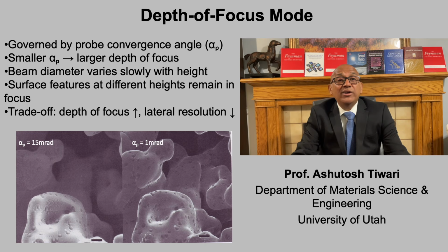However, there is an important trade-off. Reducing the convergence angle increases the effective probe size, which leads to a loss of lateral resolution. Depth of focus mode, therefore, prioritizes three-dimensional clarity over the ability to resolve the smallest surface details.